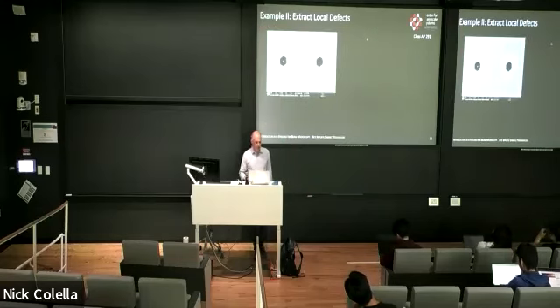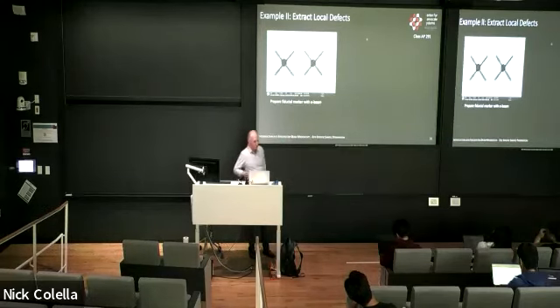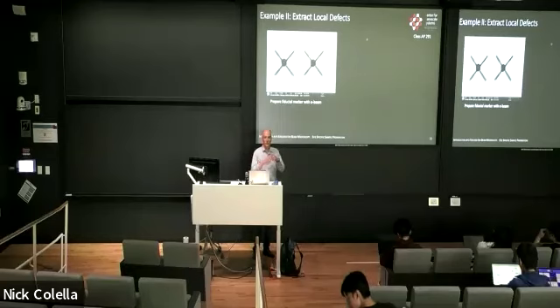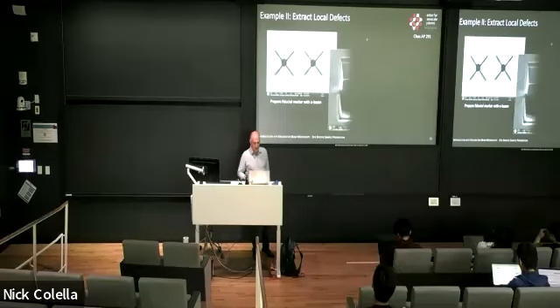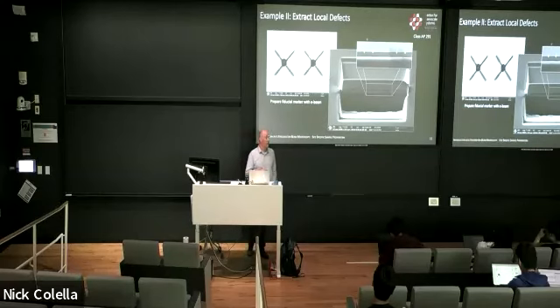So we can push that site specificity to the limit if we want. So we can again use our gas injection systems as a tool to mark specific regions. And then we can use those fiducial markers to very specifically go to very fine details. And we can go to very specific regions down to tens of nanometer precision if necessary. Yeah, so it can also be a very precise tool in that sense.